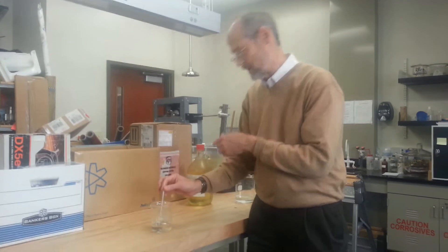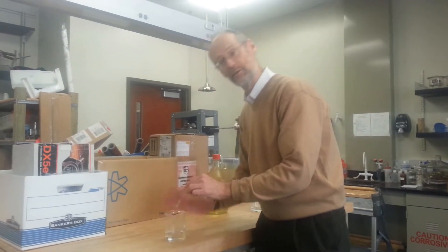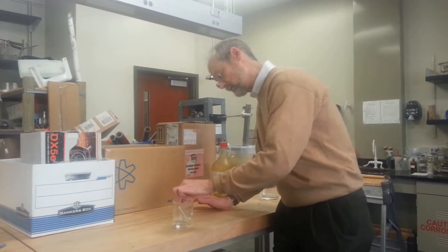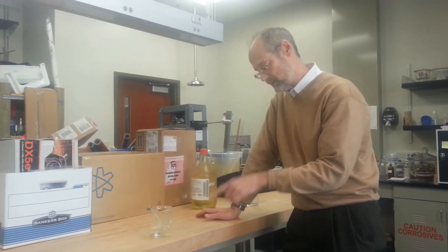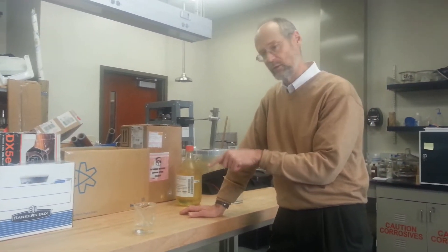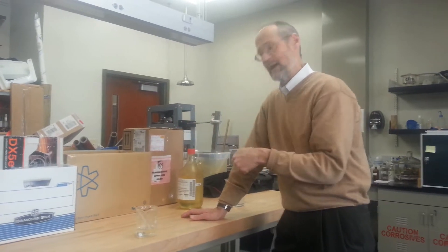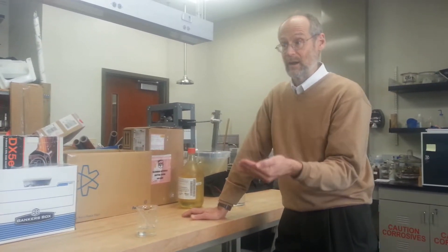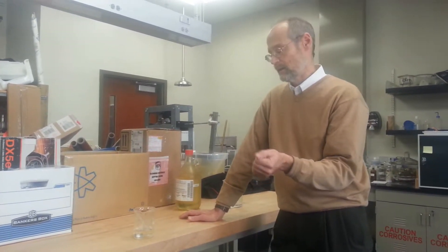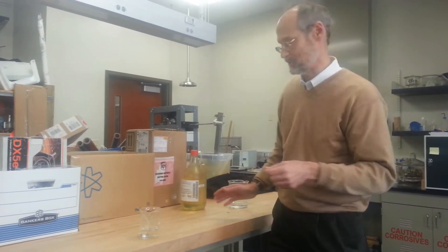So I've gone from I don't know how many molar acid to half that. What I've done now is I've gone from a situation where the iron was stable passive to a situation where it is unstable passive. What that means is if I scratch the magic paint off the surface, it will not be able to reform, and we will get a very vigorous reaction. So that's the whole demo here. Hopefully this will work.